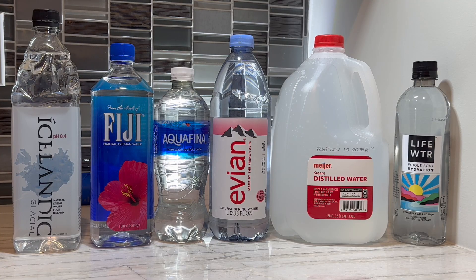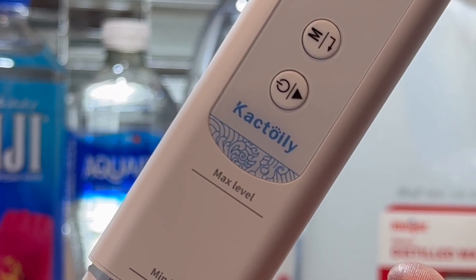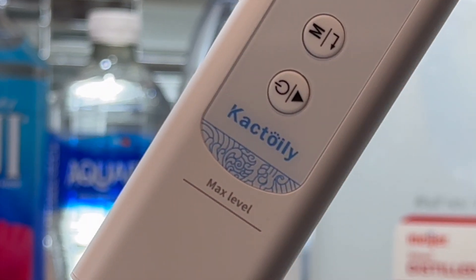Hey, let's test all these various types and brands of water for purity. To do so, we're going to use this water tester that the folks at Cactoily sent me. Check out the link in the video description if you'd like to purchase one of these.